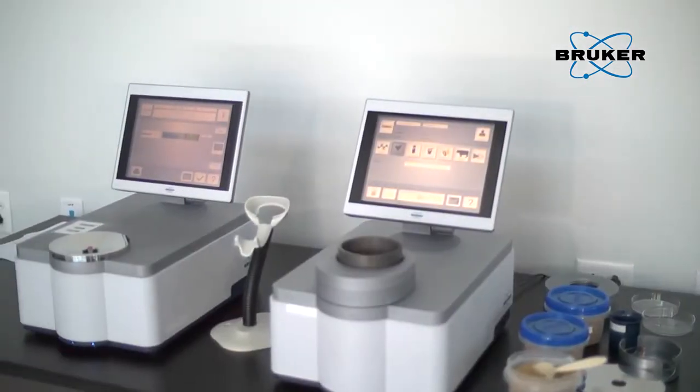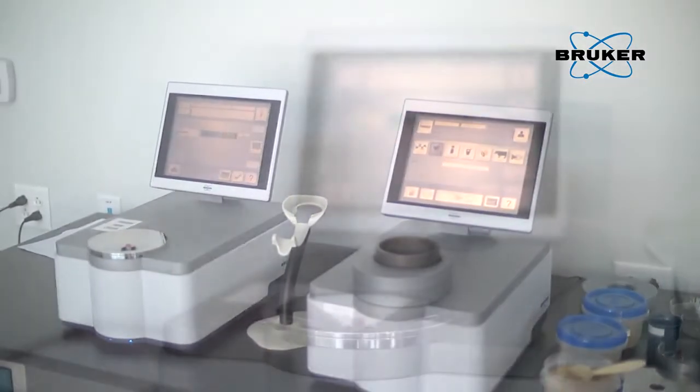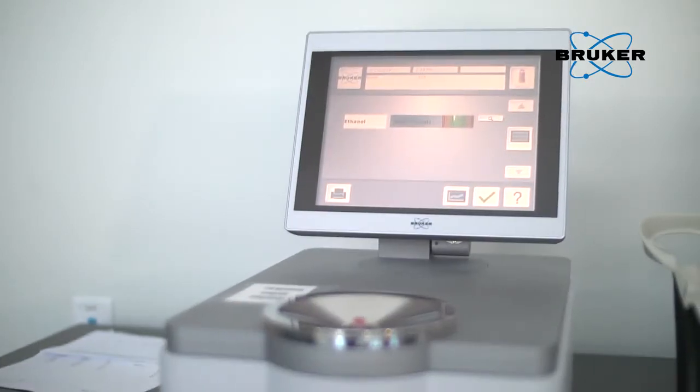There are two types of Tangos. There's the Tango-T for transmission measurements, and the Tango-R for measurements in reflection.